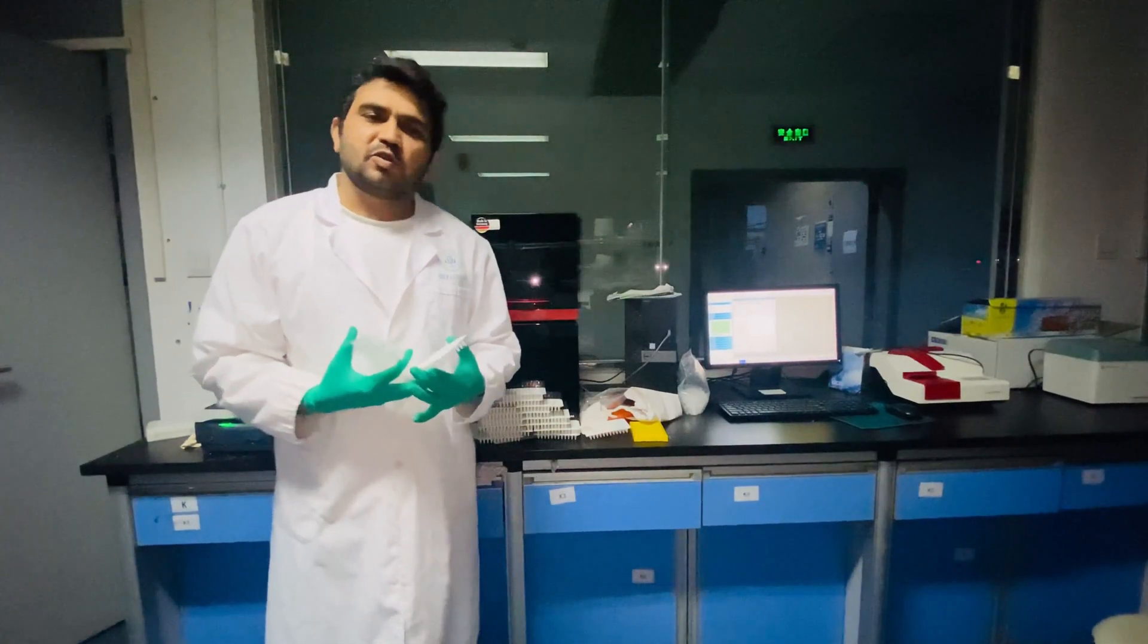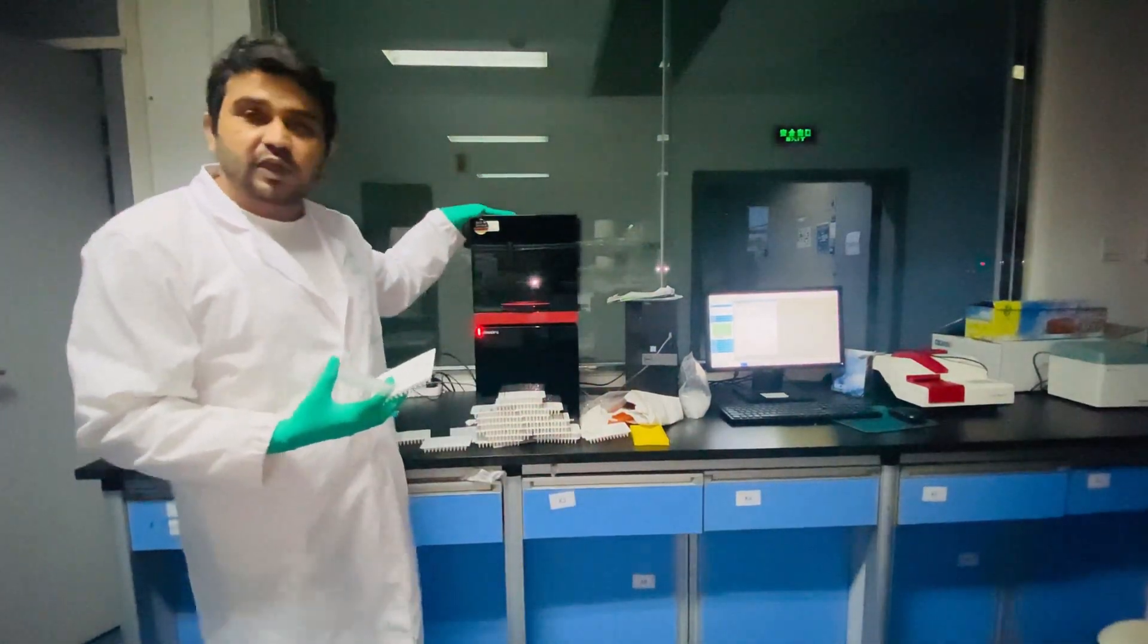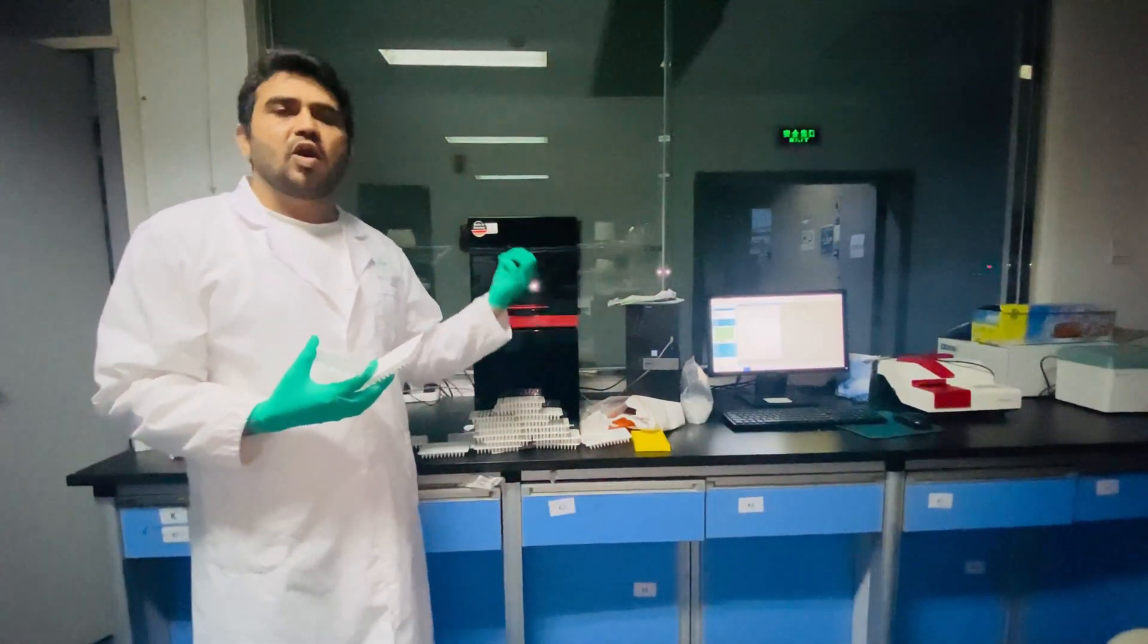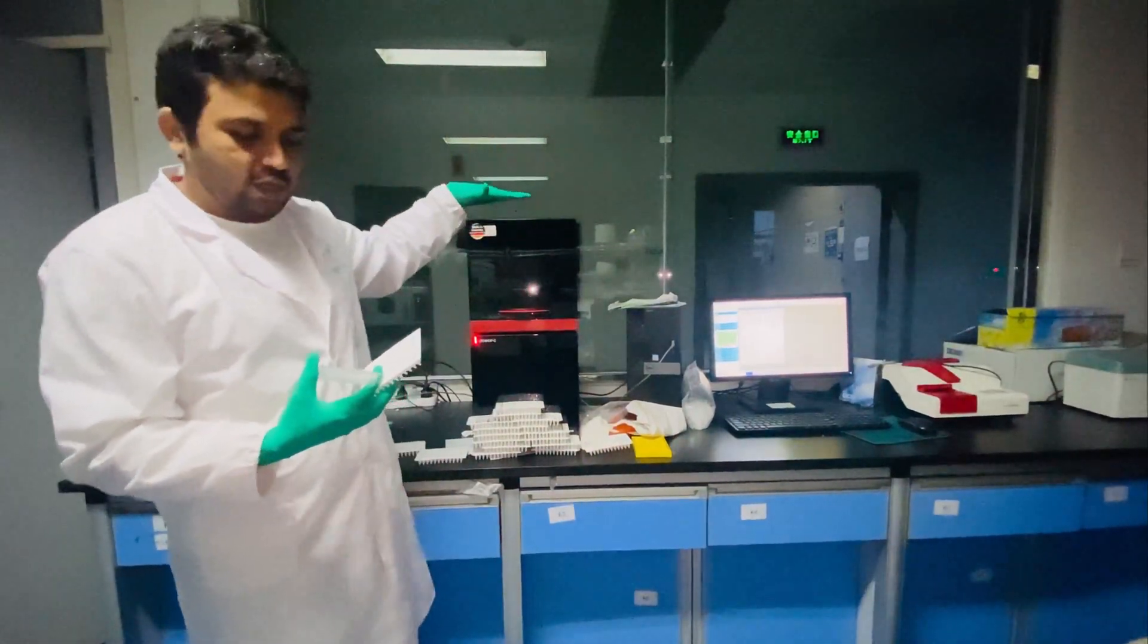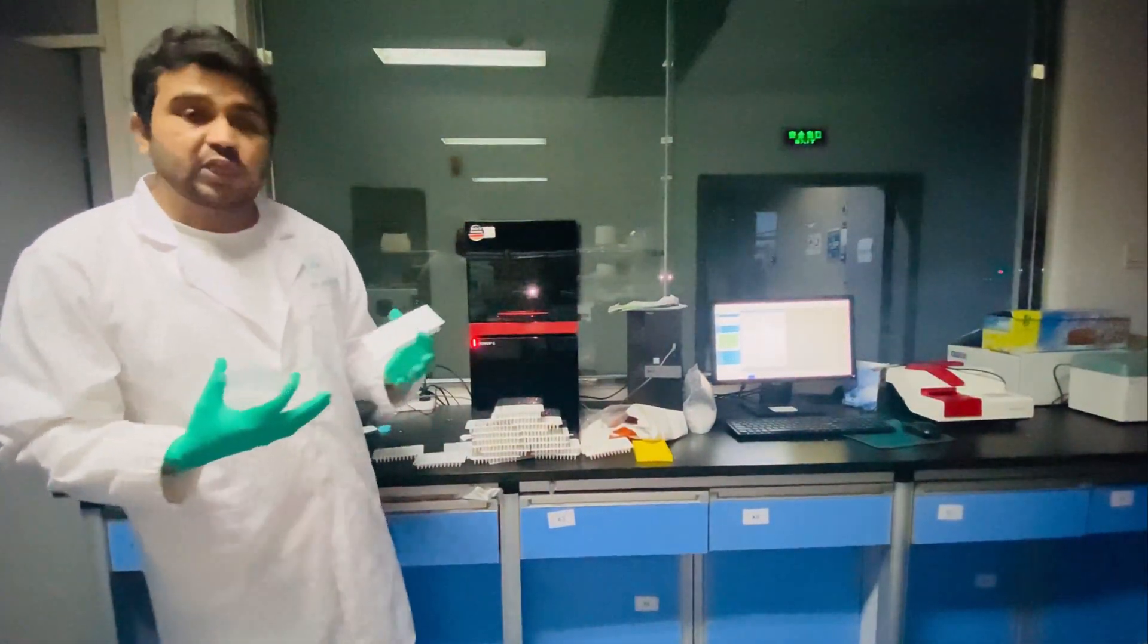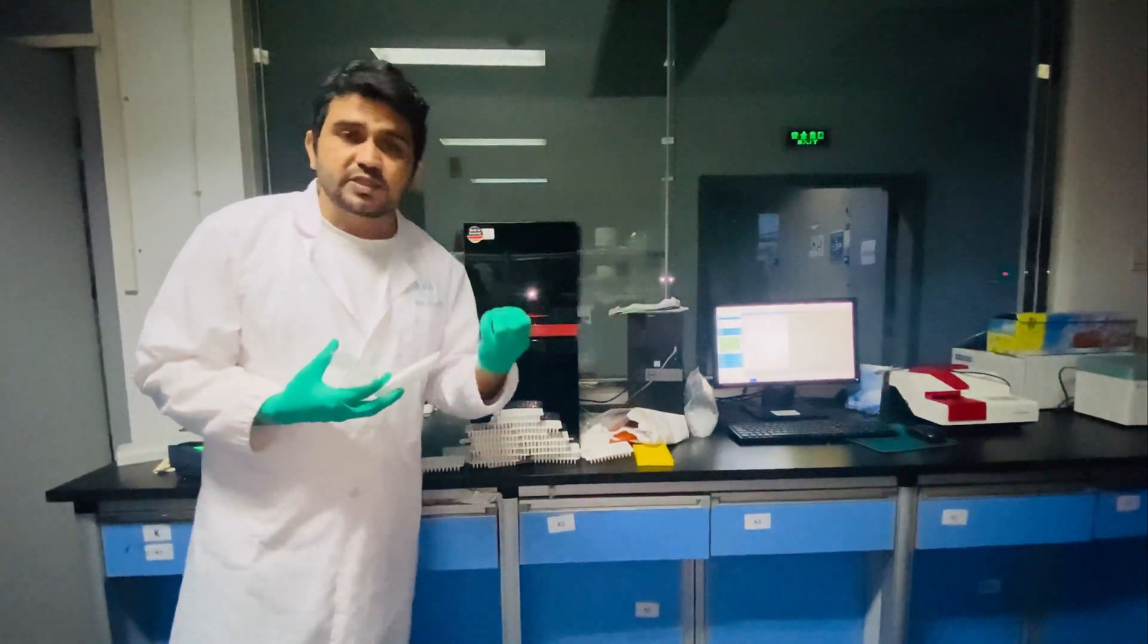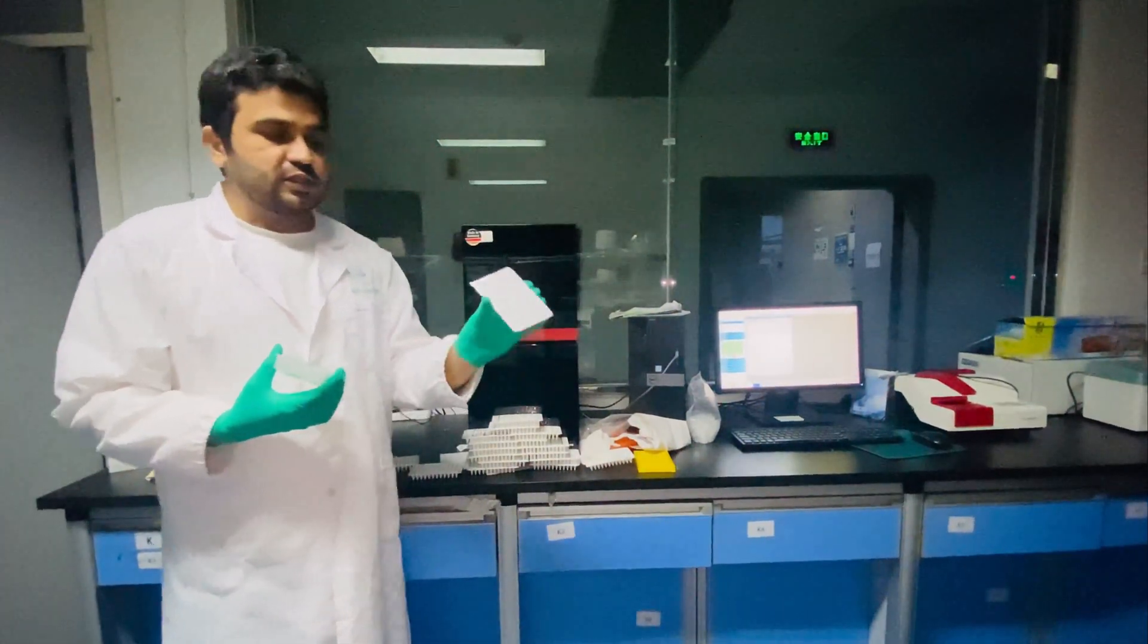Welcome to another introductory video on qPCR. In this video we will learn what is qPCR, how it works, and what is the principle of working of qPCR. So qPCR is an advanced version of normal PCR.